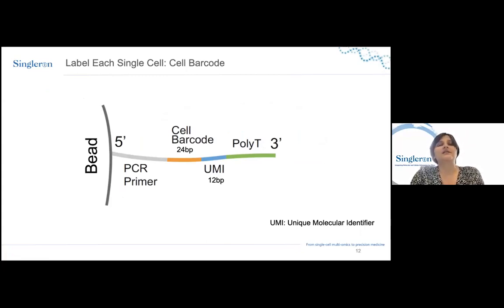Basically, every single oligonucleotide attached to the bead has a different UMI. This UMI serves later during bioinformatic analysis as a quality control measure that helps you determine how many of the mRNAs were actually captured in the individual microwell. So it enables you to determine how efficient the mRNA capture in each microwell actually was.